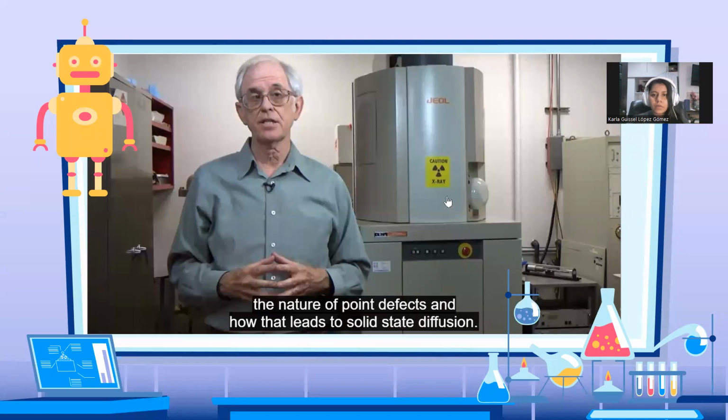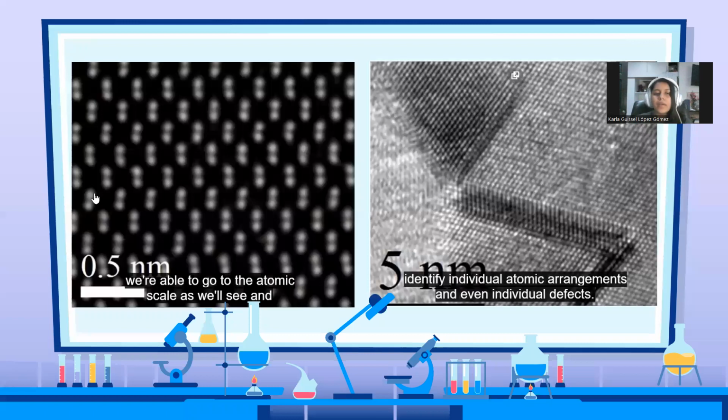I put this because behind him is the electron microscope, which is really weird, and I like it. They show us how it looks when you put a material in it and you can see the atomic scale. So you are able to see the atomic scale and identify individual atomic arrangements and even individual defects.